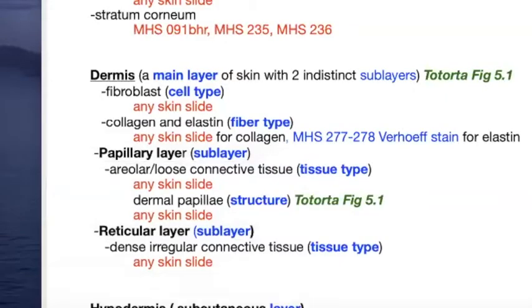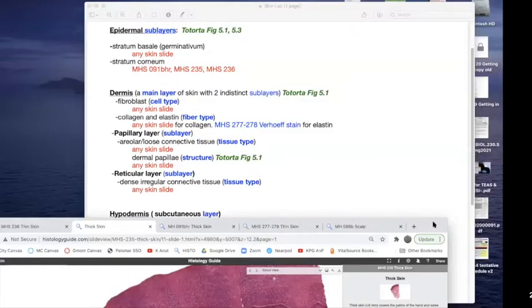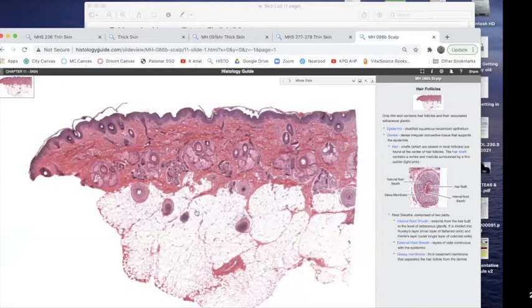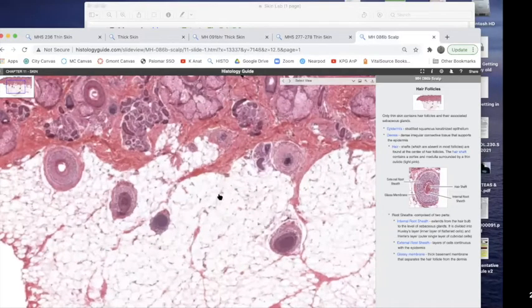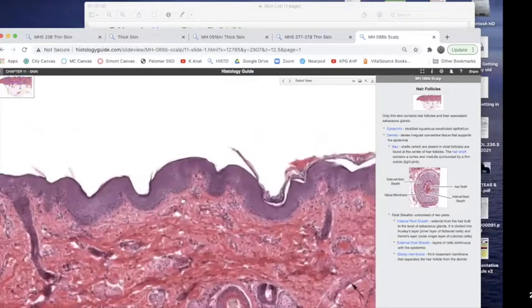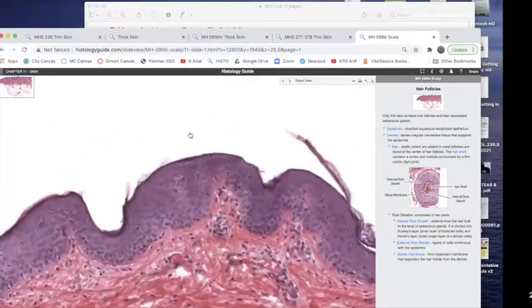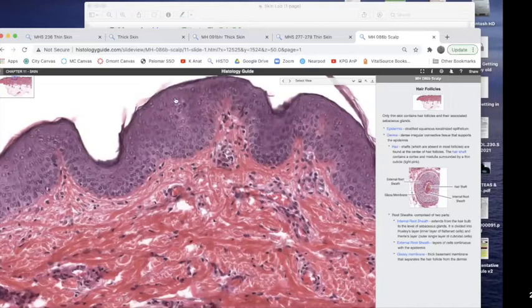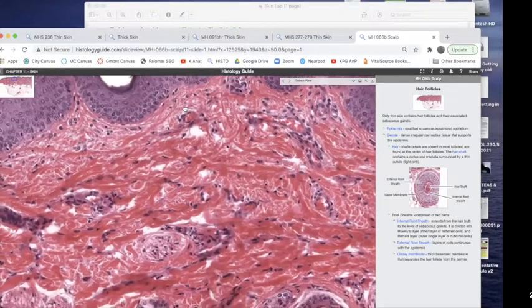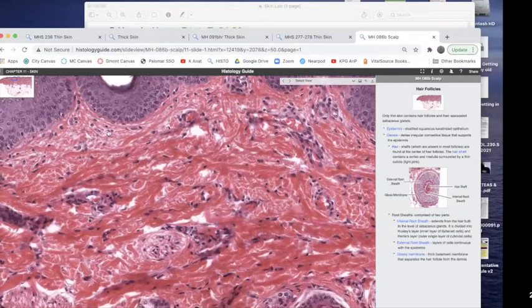And then I gave you the hypodermis. That again is just the same as identifying any kind of adipose tissue, right? So in this sample, this up here is the epithelial layer. It's in purple. You get down here, this layer, is it super distinct between loose and dense? Not so much, right? But you can kind of tell. You can kind of see the textural differences.